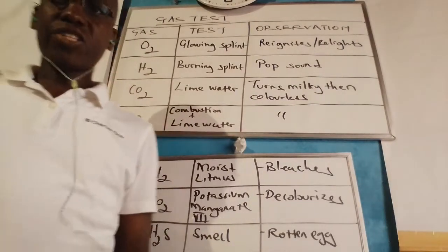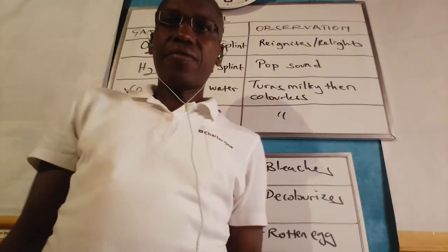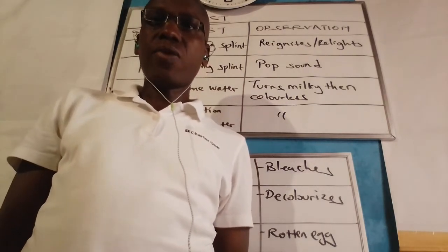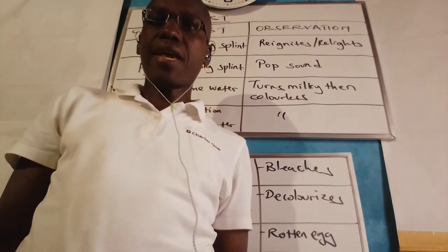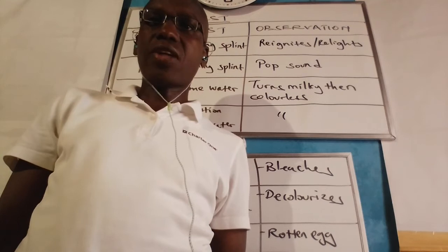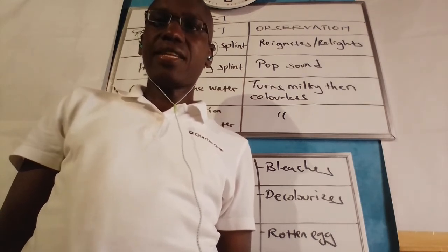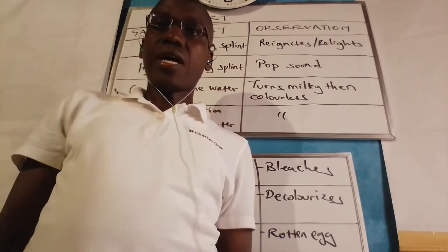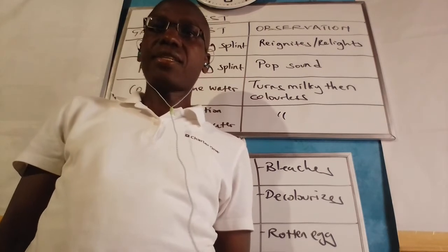Good morning. In this session, we evaluate gas tests. Now, gases have different properties, and whenever we evaluate gases, we look at their specific colors, their density in respect to air, their ability to dissolve in water, their pH characteristics, which test whether they are acidic or basic or neutral. And as we do this, our aim is to distinguish one gas from another.